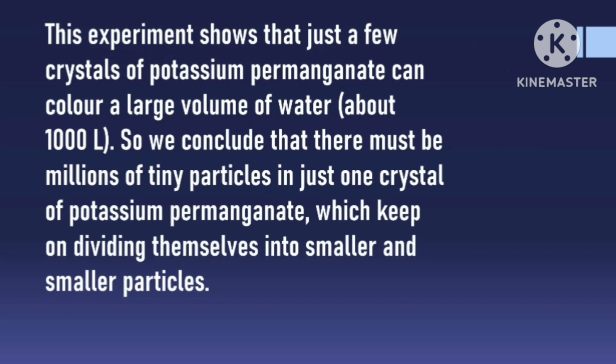This experiment shows that just a few crystals of potassium permanganate can color a large volume of water, about 1000 liters. So, we conclude that there must be millions of tiny particles in just one crystal of potassium permanganate, which keep on dividing themselves into smaller and smaller particles.